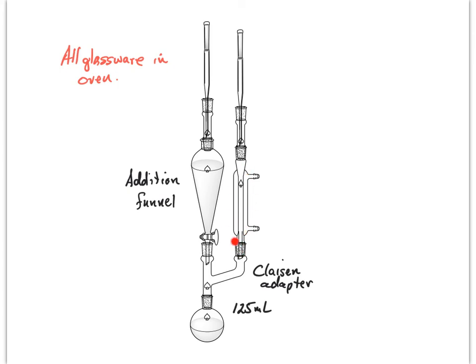We're going to have a condenser, right? Because as we make this, it actually generates quite a bit of heat, and so it will reflux on its own, right? So we want our condenser set up to capture any of our vapors. We're going to put the thermometer adapter, the rubber thermometer adapter, on the top of these two straight adapters, and then we're going to put Pasteur pipettes with anhydrous calcium chloride in them.